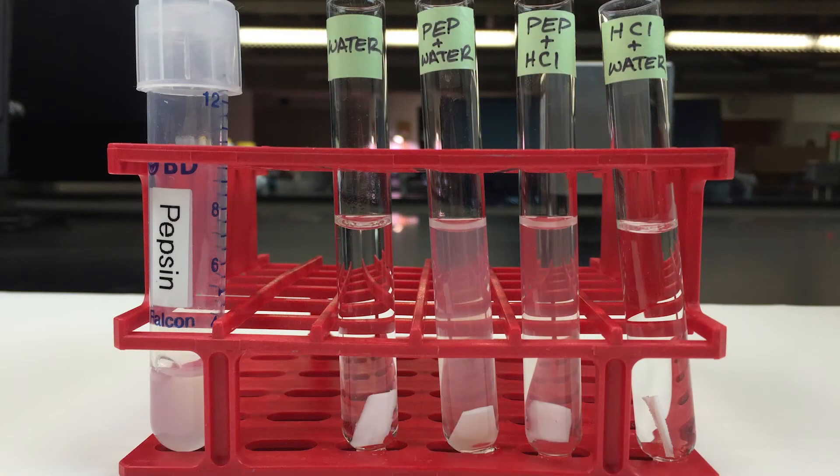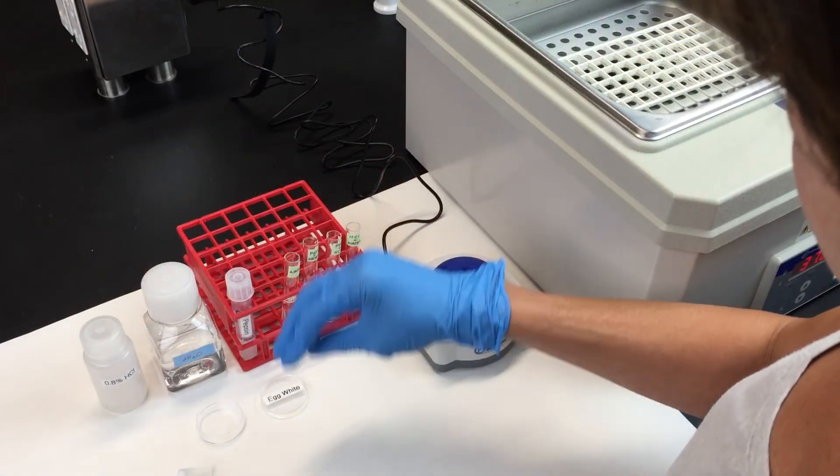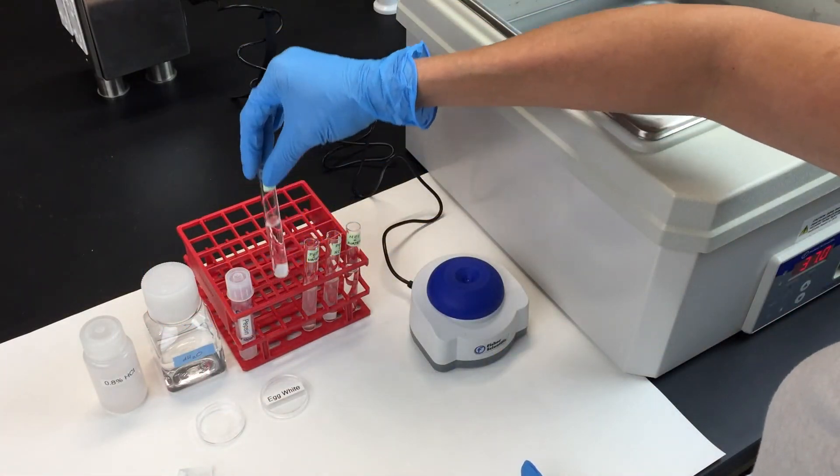Here's what your tubes should look like: the liquid is all at the same level and the egg white is sitting at the bottom of the tube. Now place the tubes in the 37-degree water bath for 90 minutes.